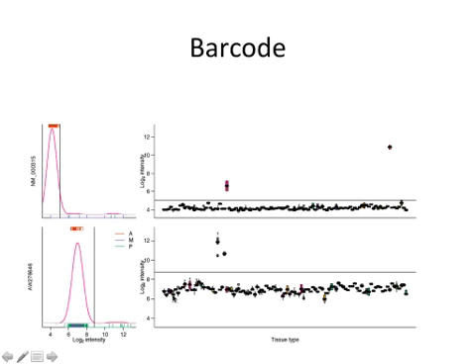And then here the same thing. It looks like these are off, and in these 2 tissues, that gene is on. So it kind of gives more credence to the statement that this hump is the off hump, and these guys are the on values.